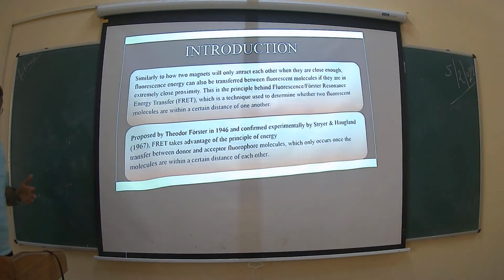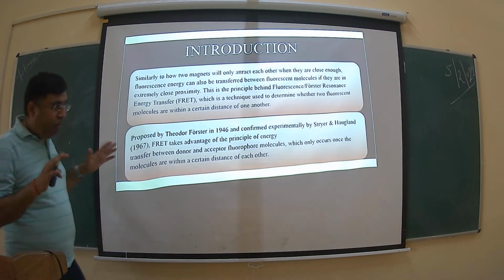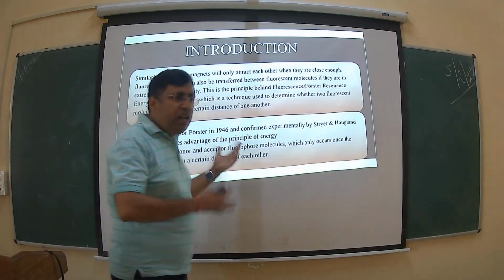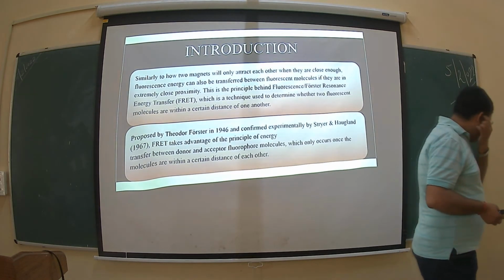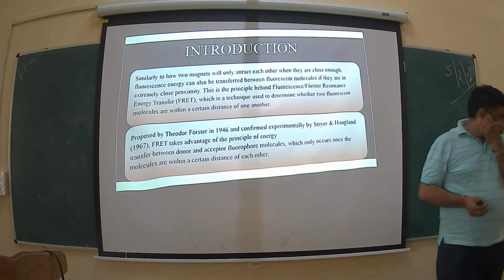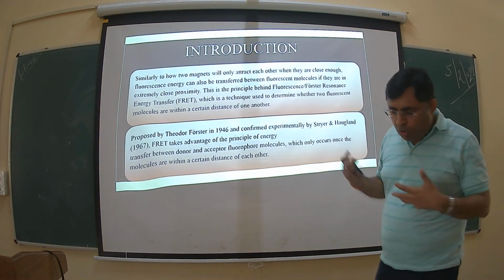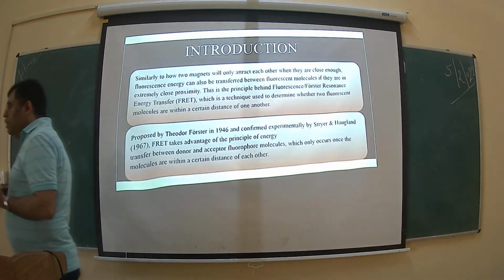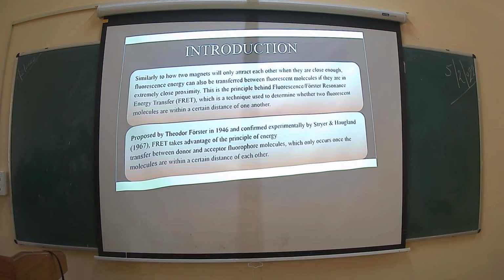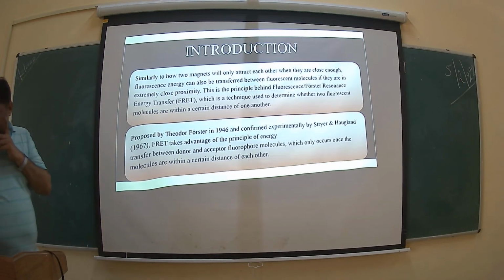Now third is a different type. All our fluorescent microscopy methods are based on the emission of fluorescence. Now the third one is FRET. So let's see what a FRET is.